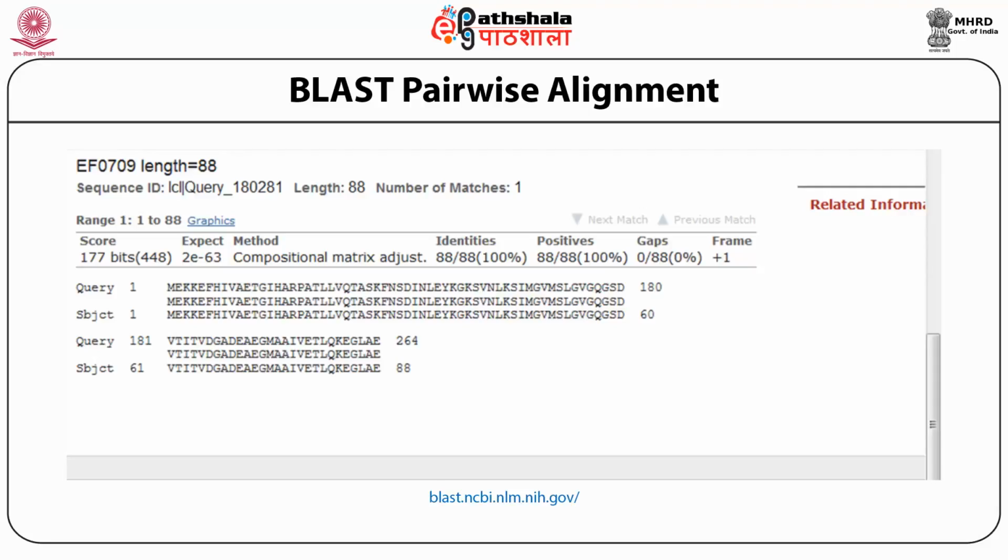However, keep in mind to match the BLAST variant with the type of sequence 1 and sequence 2. For example, when using BLASTX, sequence 1 has to be DNA and sequence 2 has to be protein. Click BLAST to receive results in the following window.